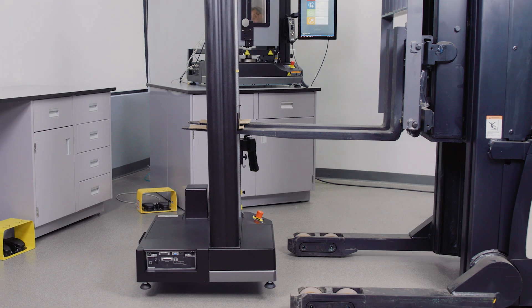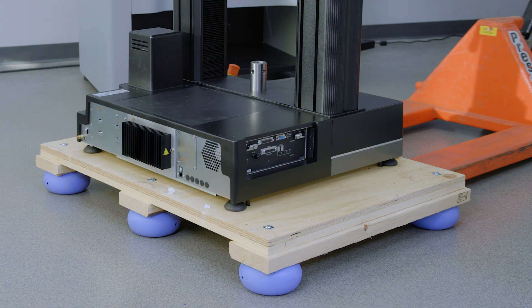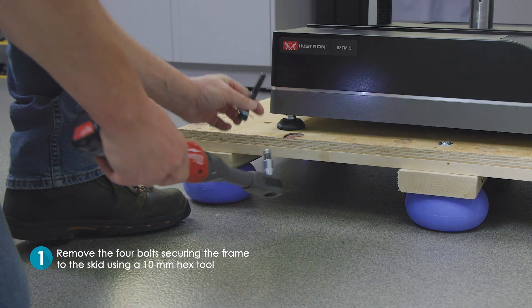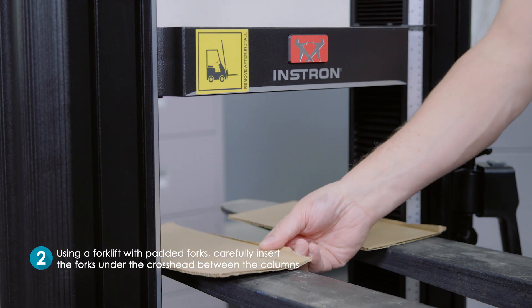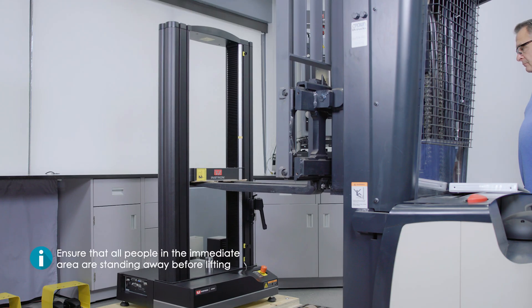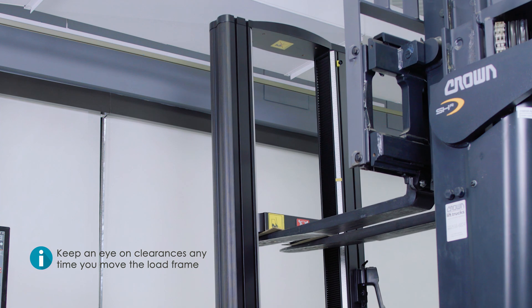The crosshead method can be used to transport the load frame to the site location or to lift the frame onto a work surface. After moving the testing system via the shipping skid method, the first step is to remove the four bolts securing the frame to the skid using a 10mm hex tool. Then, using a forklift with padded forks or protective material between the forks and crosshead, carefully insert the forks under the crosshead between the columns. Ensure that all people in the immediate area are standing away before lifting. Be mindful of your surroundings and keep an eye on clearances any time you move the load frame.